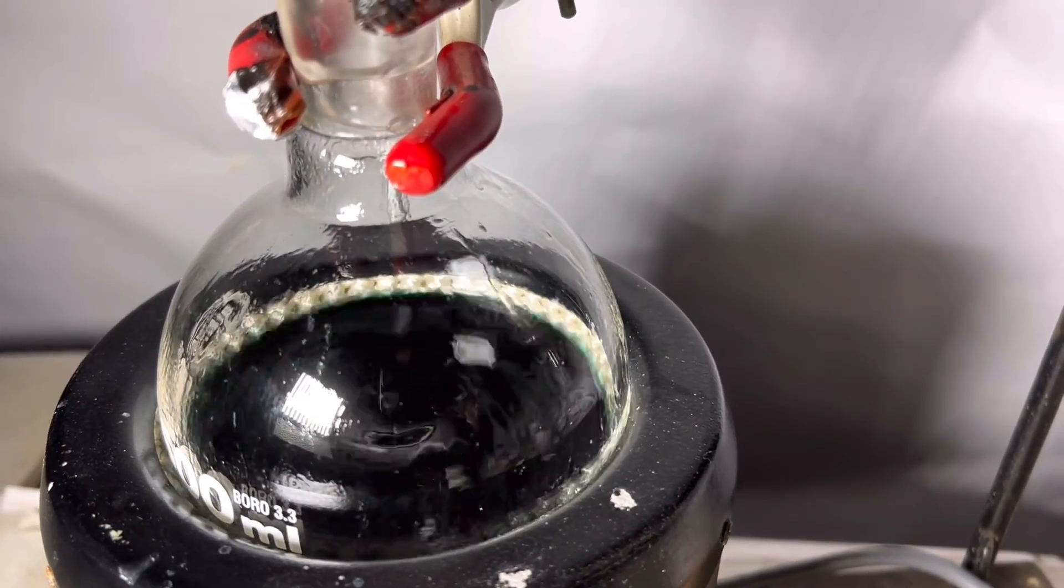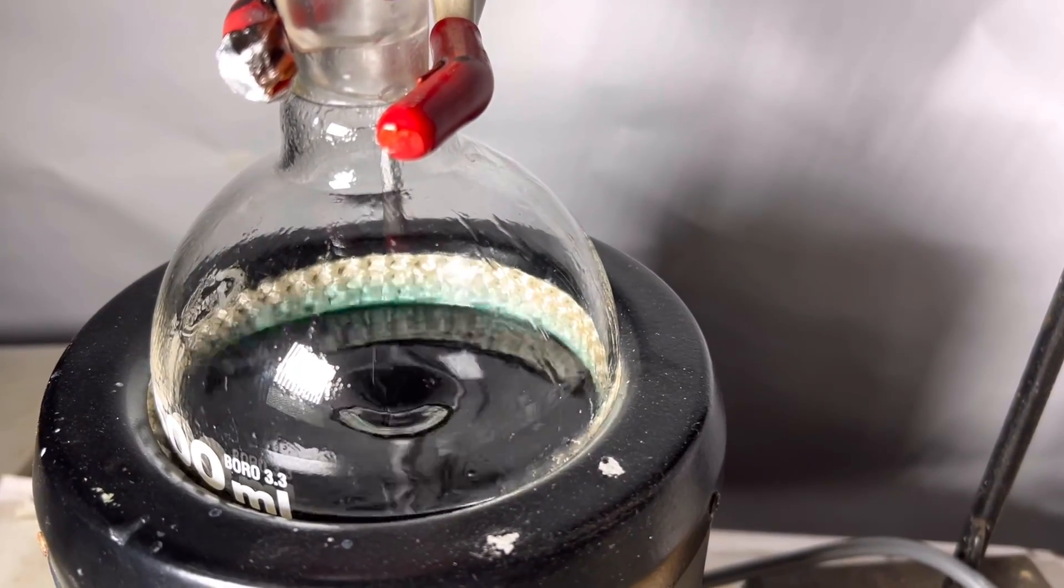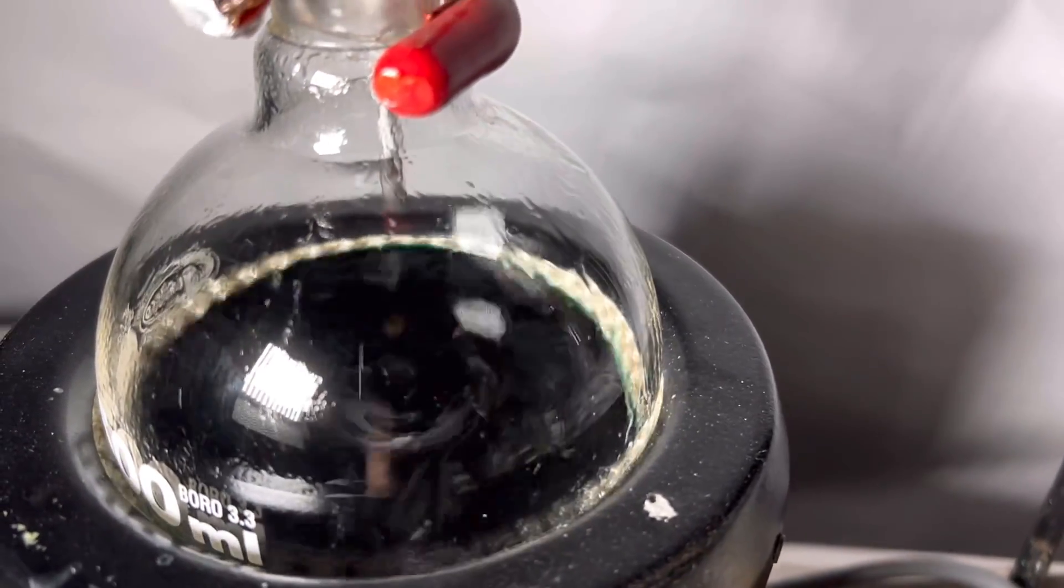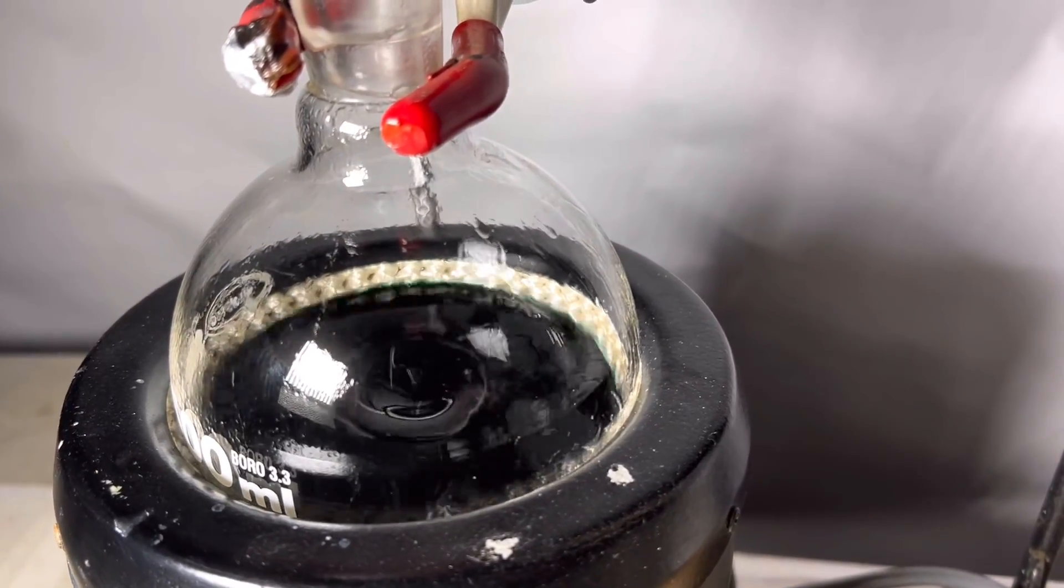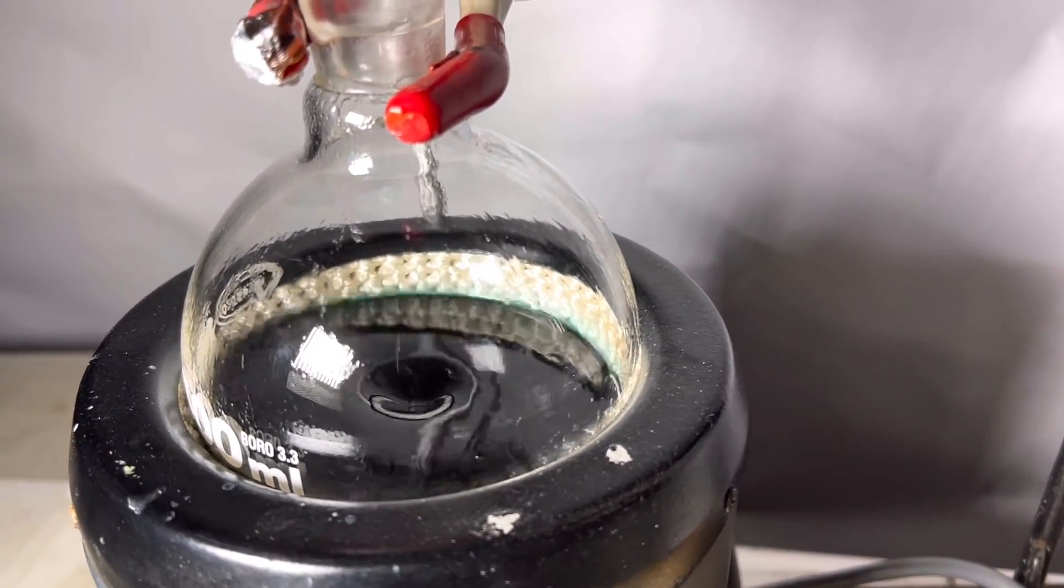After two hours we stop the reflux. The solution inside the flask has a deep green color due to the formation of the trivalent chromium. The compound formed is chromium sulfate.